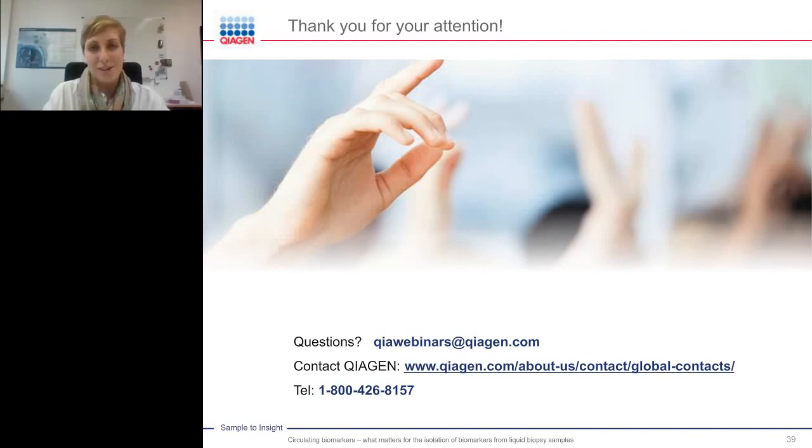Yeah, this is another really good question. So for cell-free RNA, we usually recommend to go with next-generation sequencing assays. There is a lot of different options for assays available today. You can either go into a more targeted RNA sequencing approach, but you can also do a whole transcriptomics profiling of your RNA. Another option is to do specific microRNA profiling that I was also mentioning in the poster that I showed you. So preparing a specific microRNA library and then doing a, let's say, complete microRNA profiling of your samples is also possible with NGS. And for me, that would be the method of choice today. It's now affordable and maximizes the research questions that you can answer with your data set.